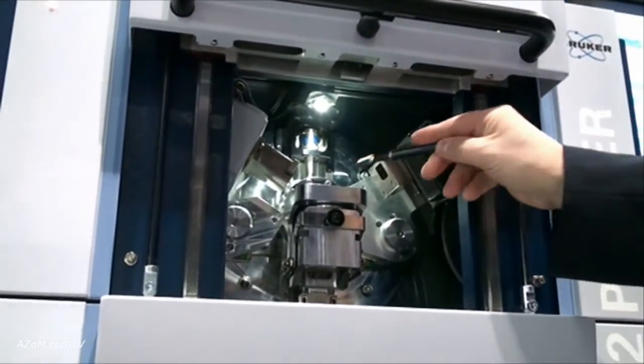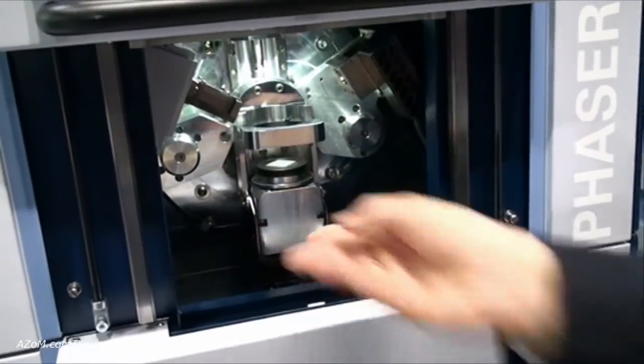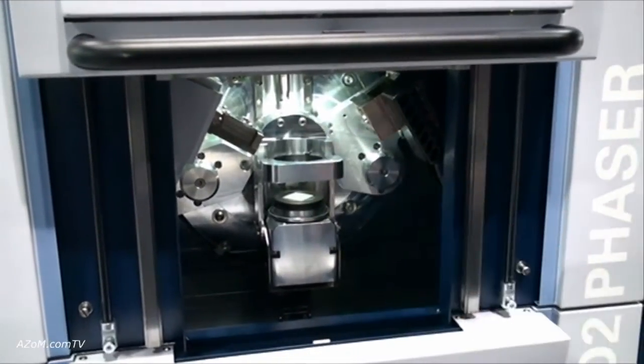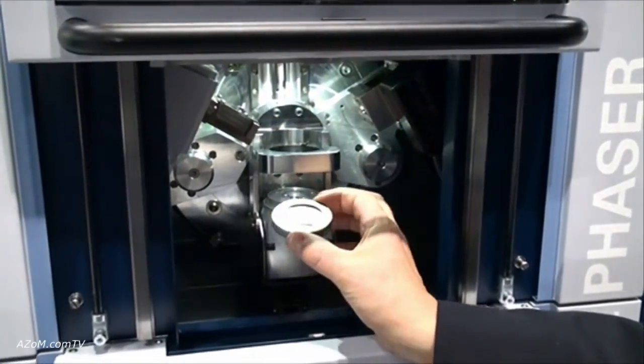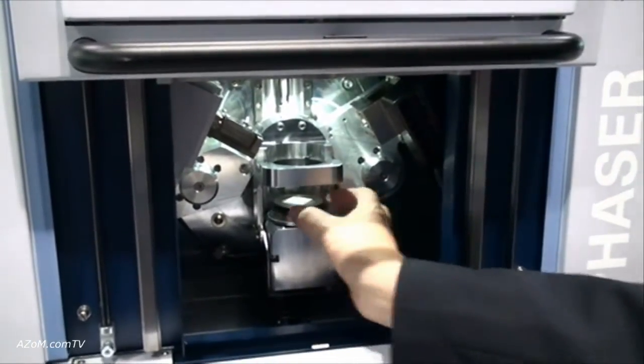We have a sample spinner with an innovative sample loading system. A unique feature is the standard 51.5 millimeter sample holder — an industry standard that you would use on your other XRD systems.